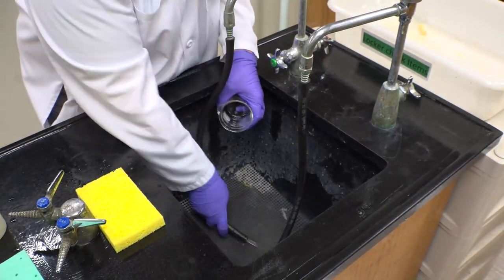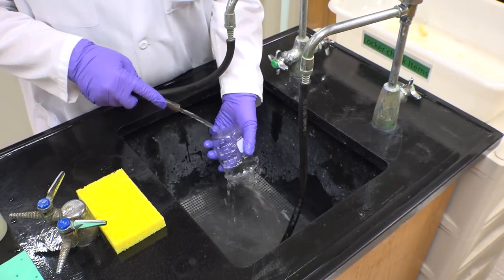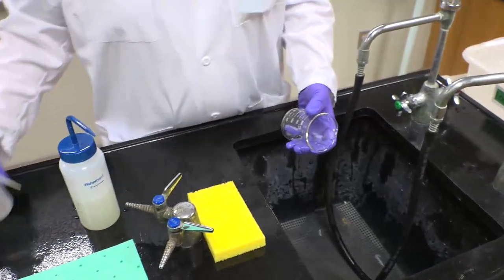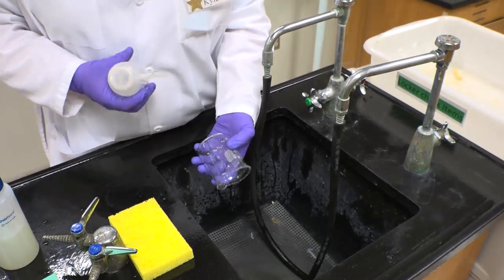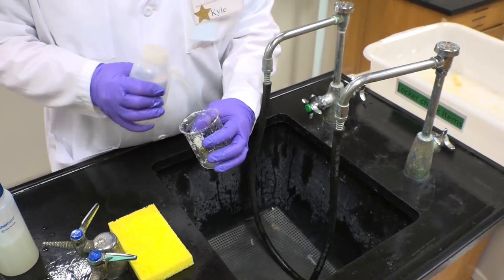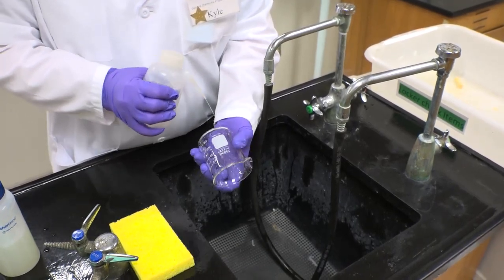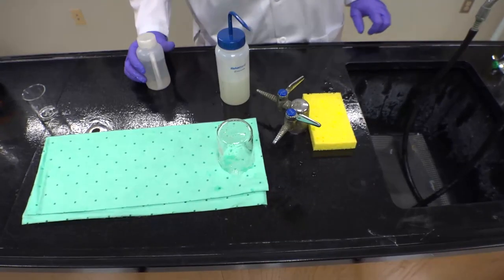to make sure that there is no remaining soap residue. From there, you want to rinse the beaker with DI water at least three times. The sequential rinsing helps to assure that you have rinsed away any contaminants in your beaker. After you finish rinsing with DI water, you are left with a clean beaker.